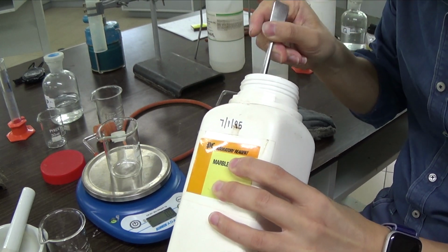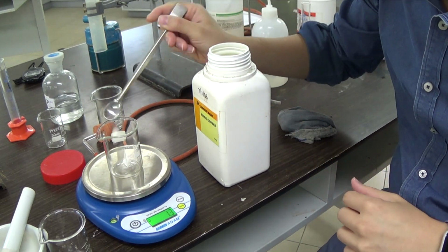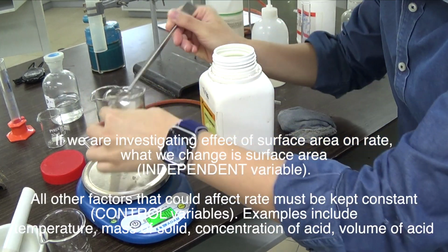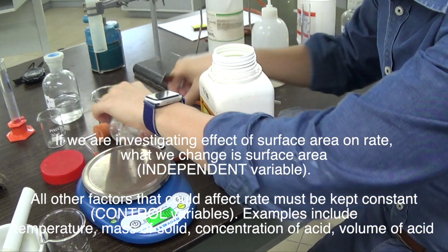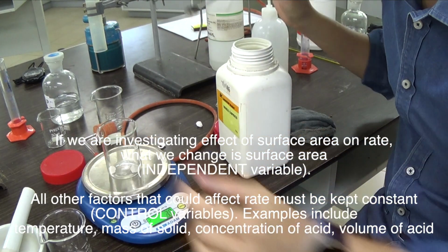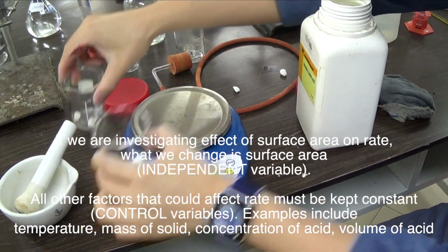When we are investigating surface area, we do not want to change any other thing. We want the other factors to be exactly the same. There is 1.3, there is 2.2, that is no good. We want as close to 1.7 as possible. Nope, there's still too much there. Let me try and get this right. I don't think I'm going to get it right. So there is around 2 gram there. Not too sure if you can see that properly. So there is around 2.0 gram.